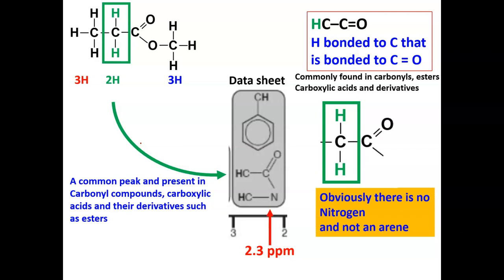Clearly there's no nitrogen in our compound, and obviously it's not an arene, so we could ignore those other 2 potential bonds and potential groups.